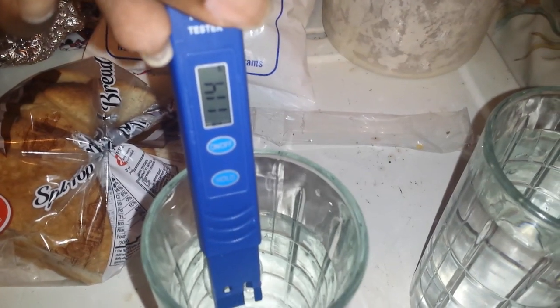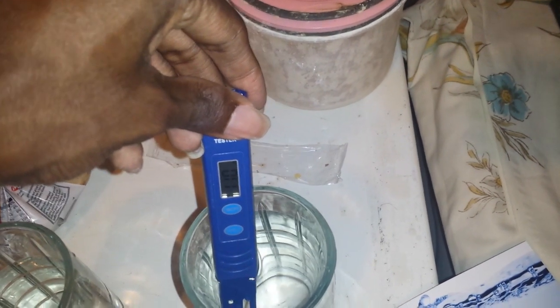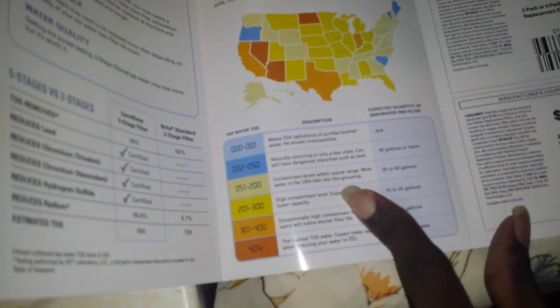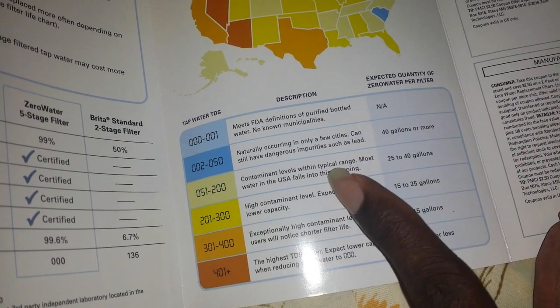Testing out this ZeroWater filter. The regular tap water is sitting at 113, and the shower water is sitting at 110 — which I'm disappointed in, considering it has a filter on it. According to this, it's still within most state levels. I'm in North Carolina, so I fall within the typical contaminant range for my state. These are exceptionally high ones.